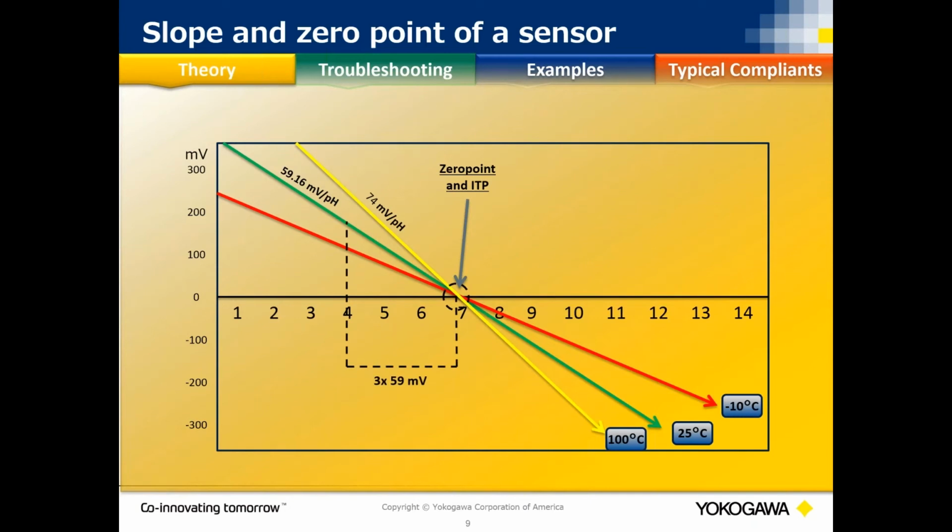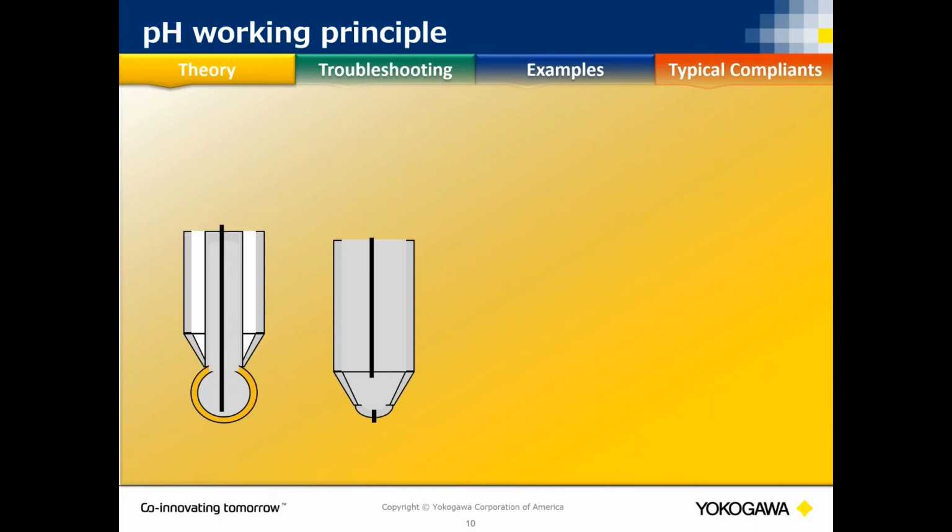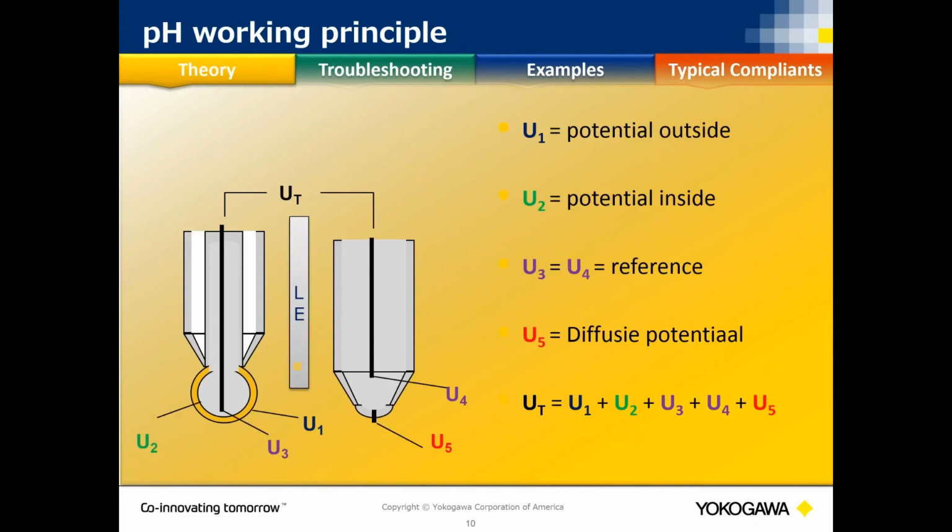Now, you have an entire circuit in that electrode. It's an electric sum, and all we're measuring is the voltage potential, basically that U1 shown here, those hydrogen ions reacting on that glass electrode. Everything else, U2 through U5, should be equivalent to 0. However, if that U5 gets coated, plugged, or fouled, that will increase and change your ORP measurement.